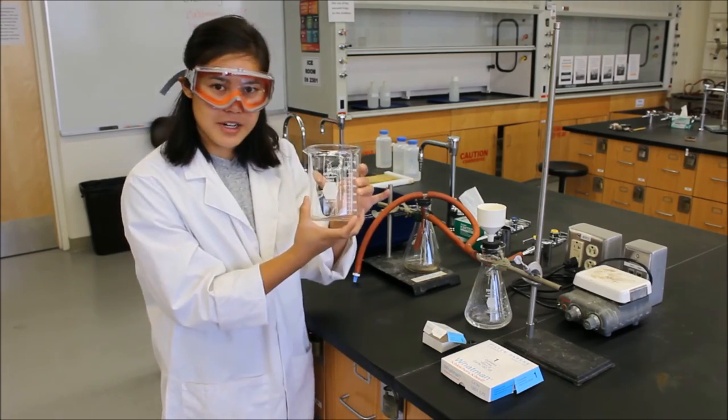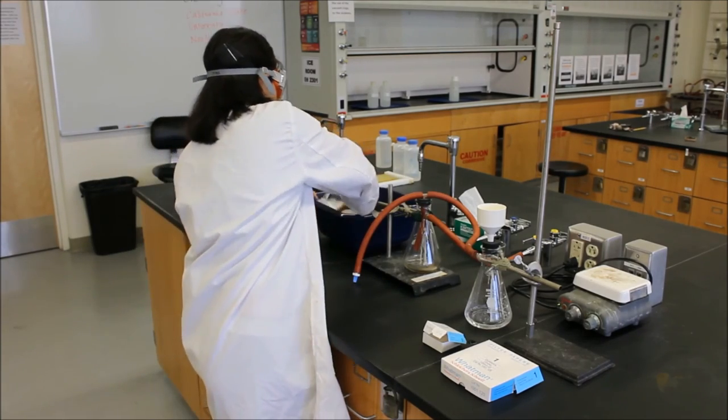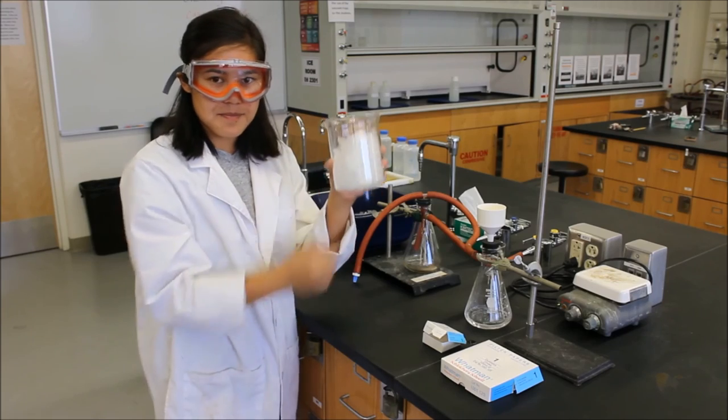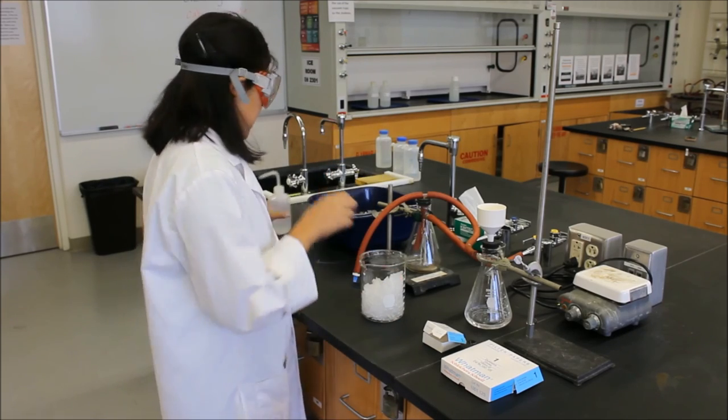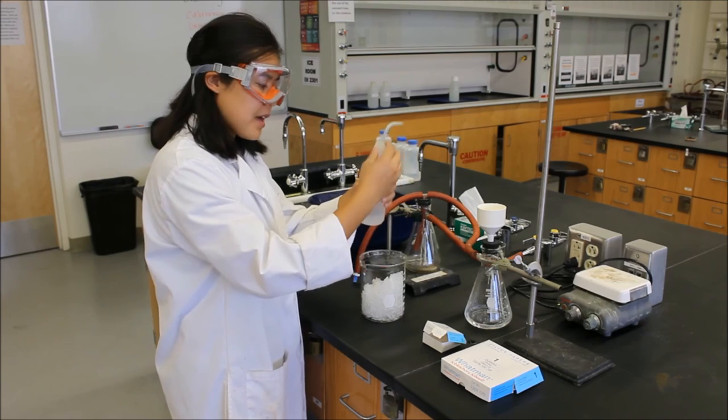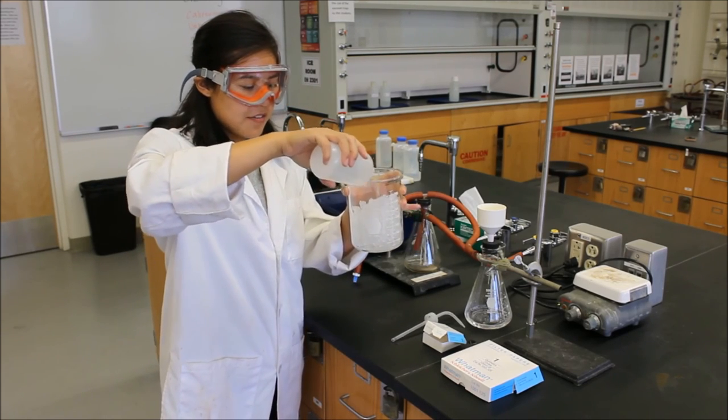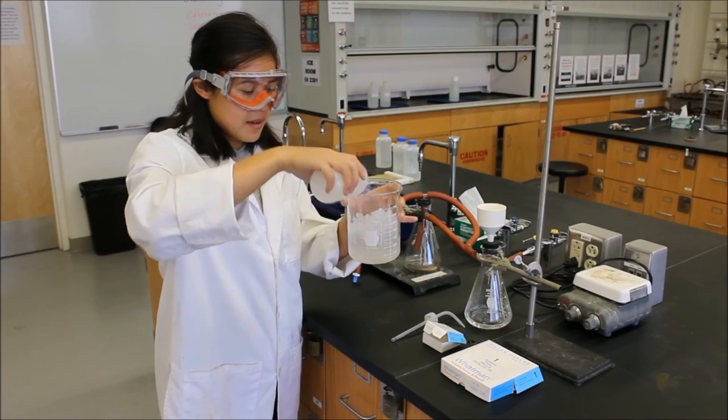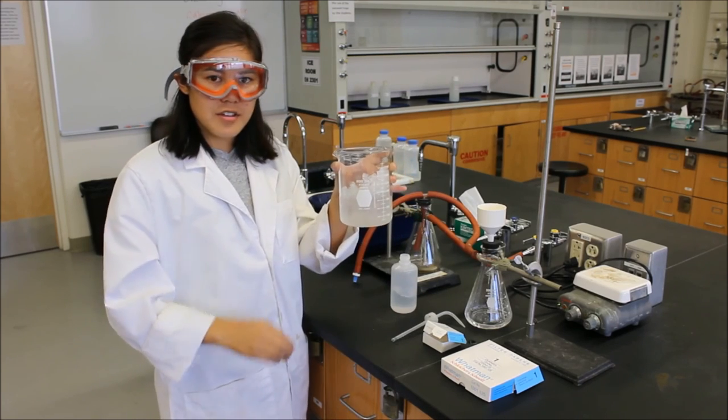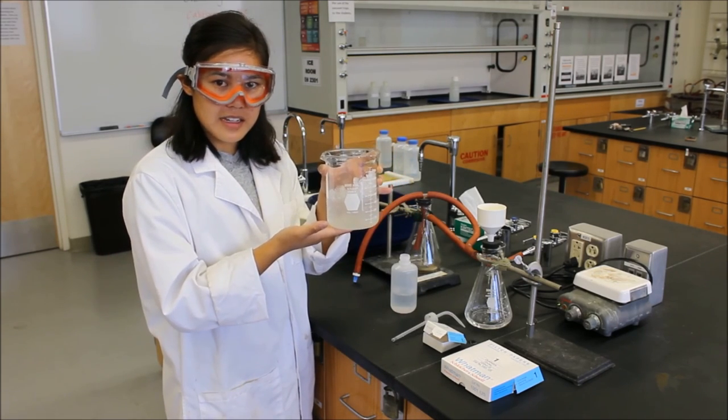So, you get a large beaker, put some ice in it, and you put some water in it. Now, the reason that we have to put some water in it is because we want to increase the surface area of the bath so that it cools your beaker nice and evenly.